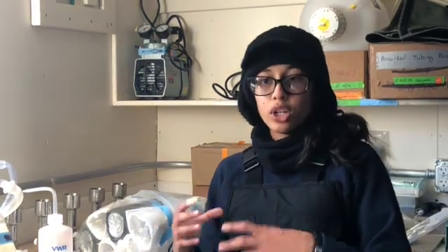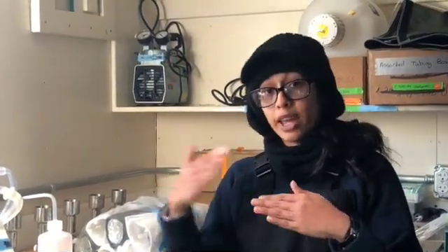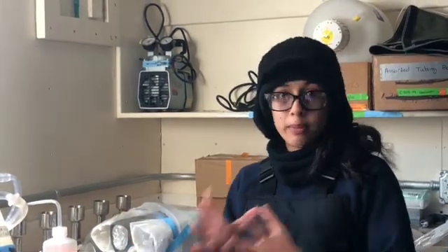So our experiment is adding salinity, or adding a little bit of salt, to water from a particular depth that we collected, and observing how the microbes shift over a period of time.